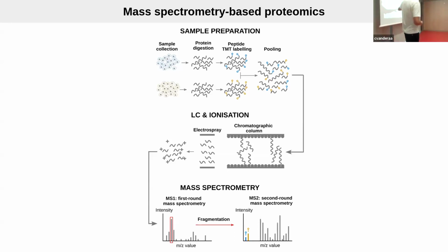and mass spectrometry. So the liquid chromatography idea is that the pool of peptides is gigantic, so you want to reduce the complexity by separating peptides, typically based on the hydrophobicity. Once they elute out of the LC, they are ionized. So again, what we're measuring in proteomics is not proteins, but peptide ions. Once ionized, they can be sent to the mass spectrometer.